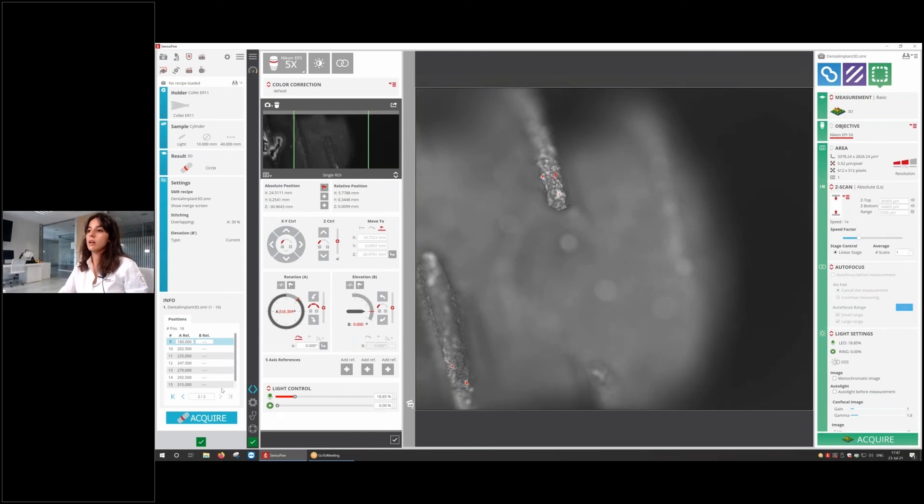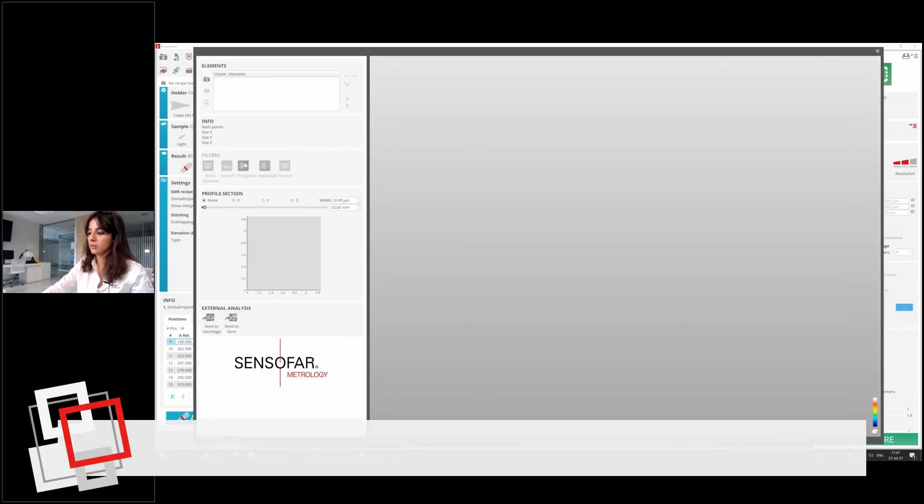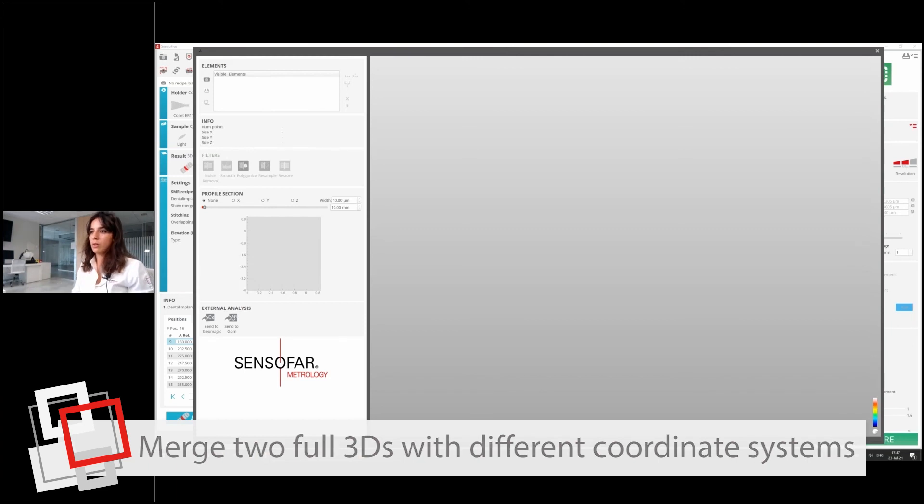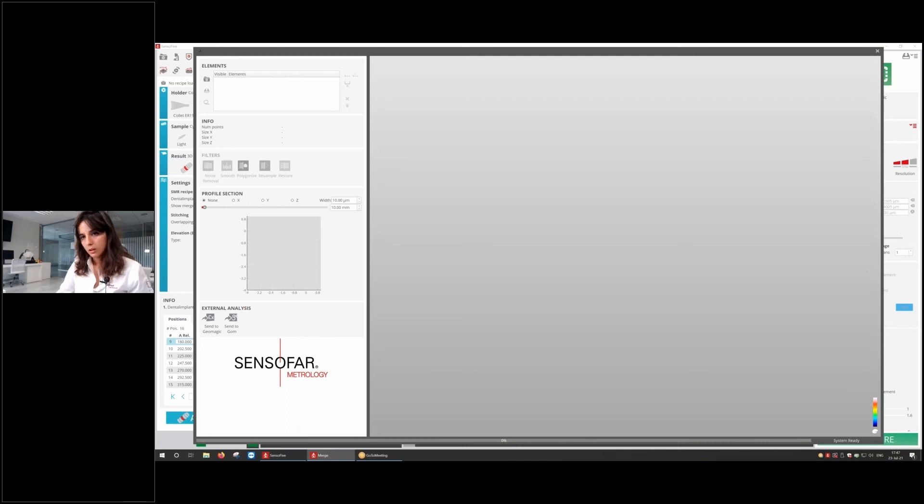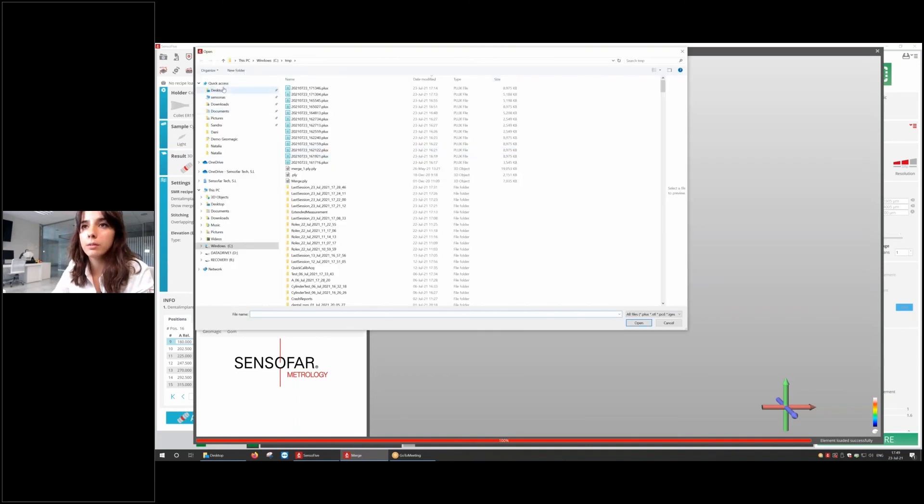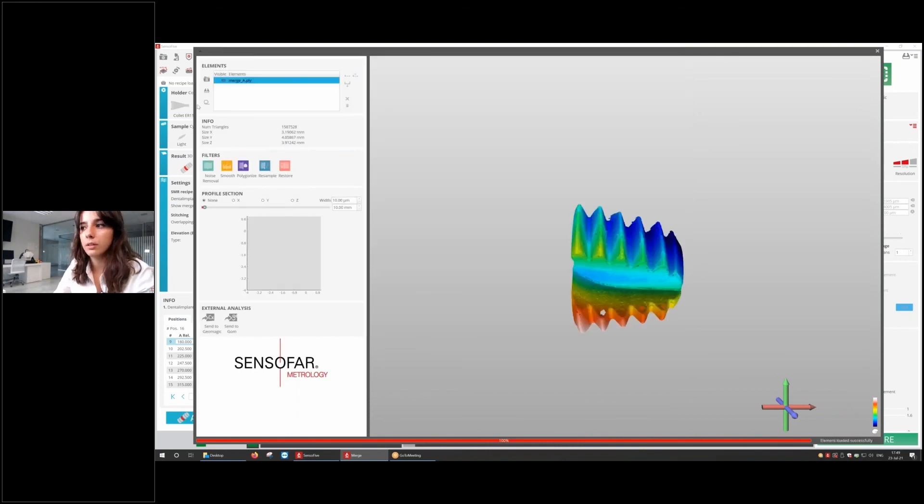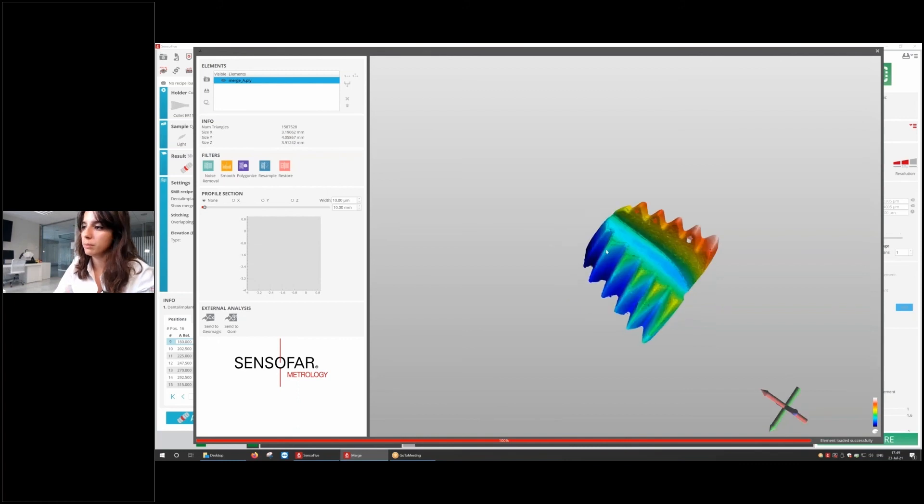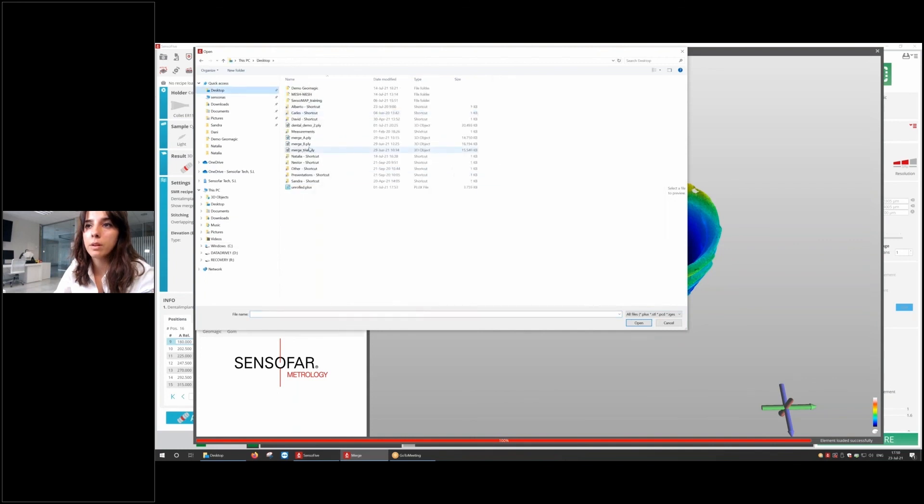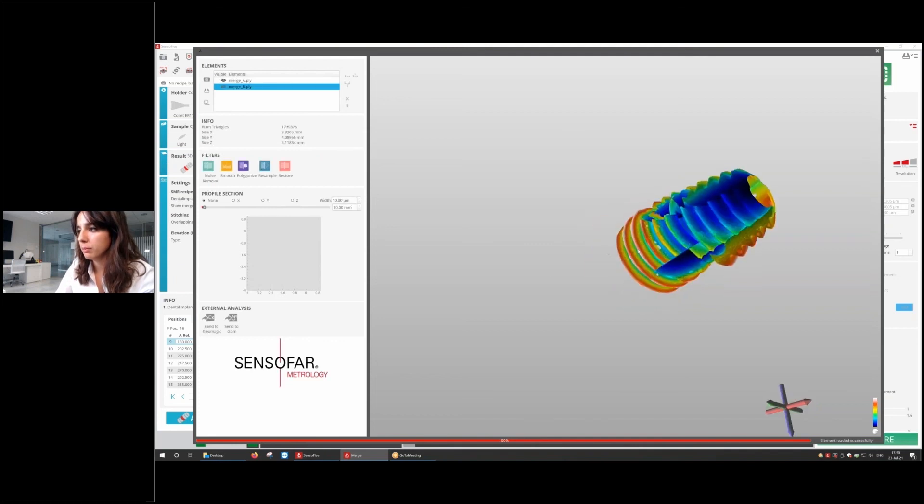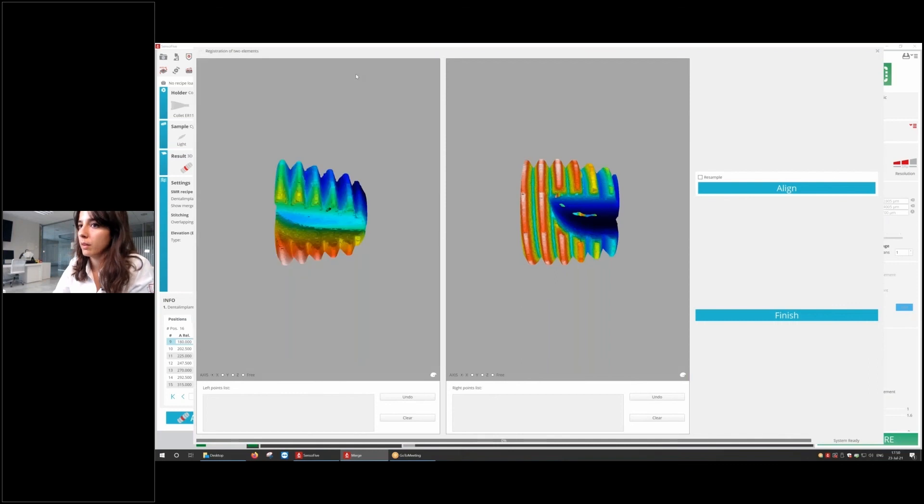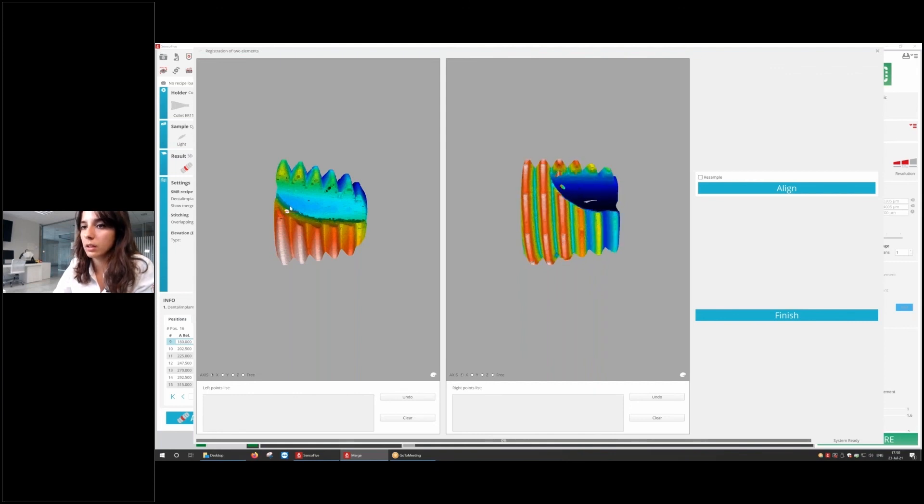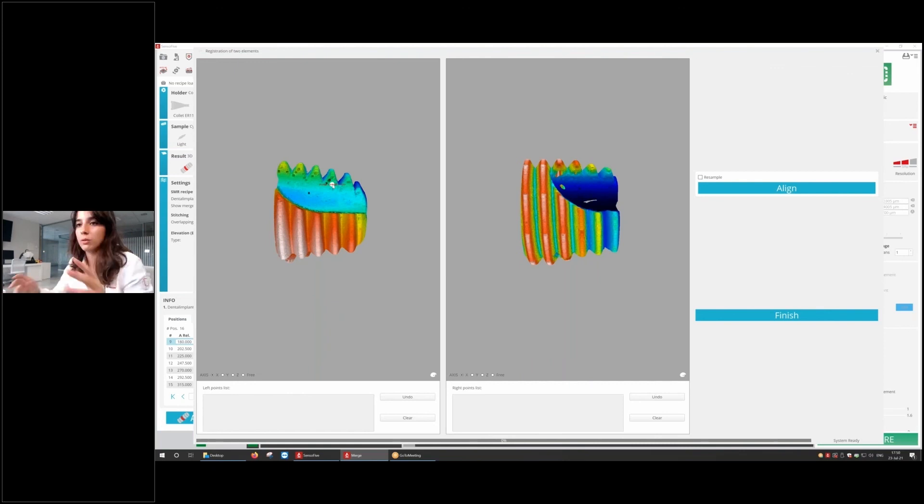The following capability is that we can merge different sets of data that don't share the same system of coordinates. Now I can register the two samples by using some points. Let me show you. I'm going to load two different full 3D. Let's open first this one, which is the tip, the very tip. And then let's open another one that's going to be close to the tip, but not exactly the tip. In order to do the registration, we're going to go here. There's another full different interface in which we can select the different points that these two measurements share so it can do a merge.